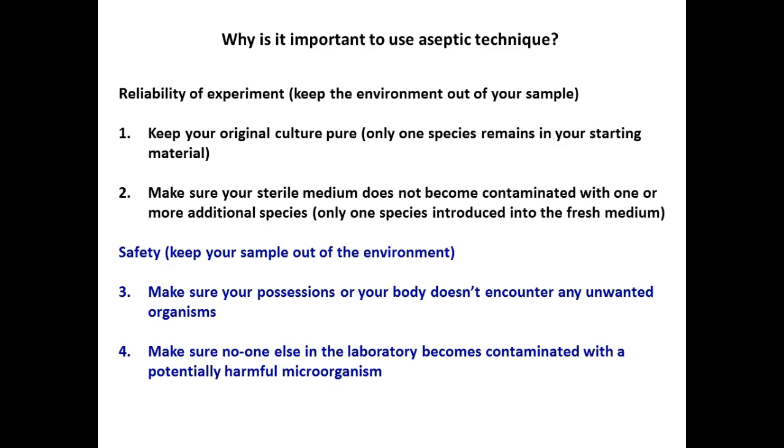Make sure no one else in the laboratory becomes contaminated with potentially harmful microorganisms. Klebsiella pneumoniae can cause a really serious form of pneumonia. No licking Petri dishes, right? Nobody wants this. You'd have to come in contact with large numbers of these organisms to get sick, in direct contact with the Klebsiella pneumoniae. But we don't want to contaminate our environment, where they could potentially grow to large numbers and someone accidentally gets exposed to these things.